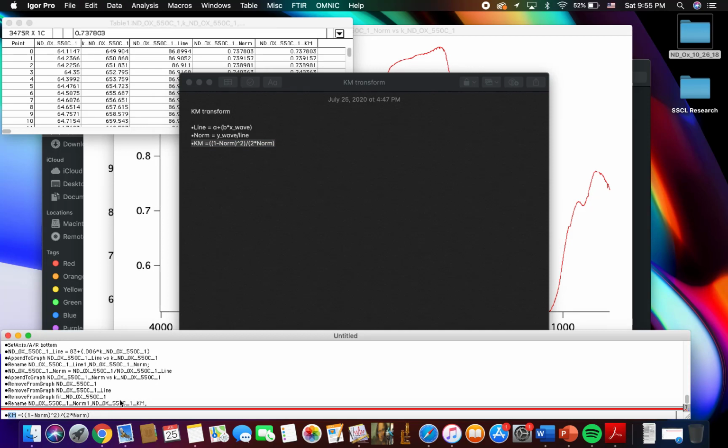Select Km and substitute your sets. So you have Km, substitute for the Km file. You have your norm, find the norm. Norm is right here. Again, it doesn't matter where you find it, just as long as you find it. And there you have it.